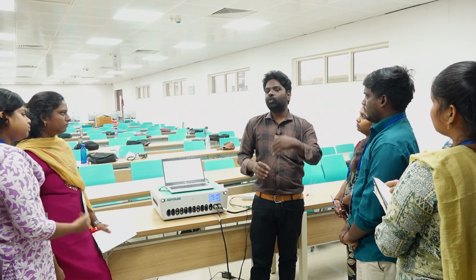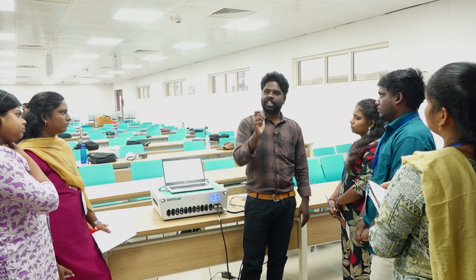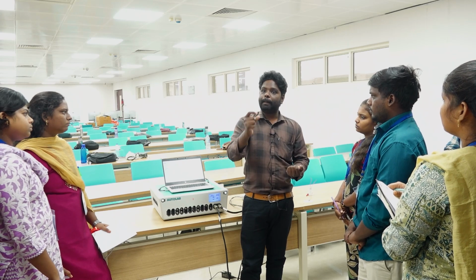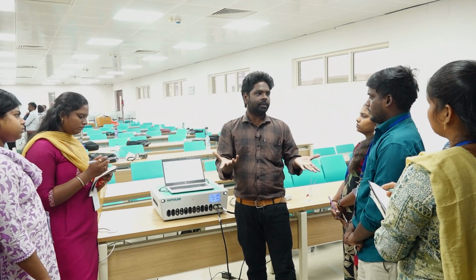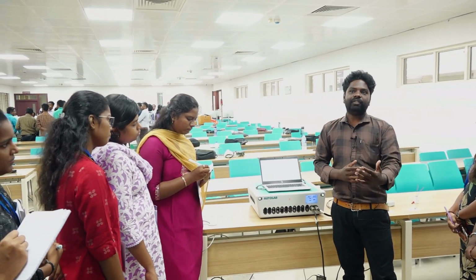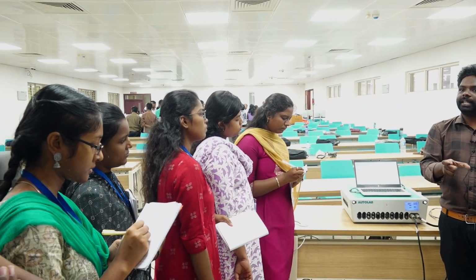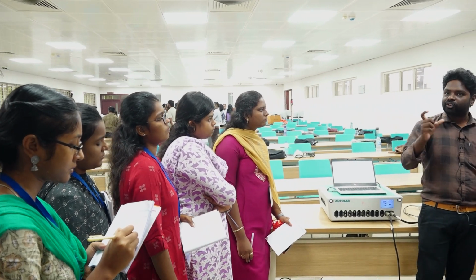So comparatively, if you take any other technique like CV, LSV, whatever the DC techniques, that is a destructive technique. That means if we are testing our sample, your sample must get destructive. We are applying input, we are polarizing the material, and your material will get disturbed, but in EIS it won't disturb much. Still we can measure whatever the actual properties of the material, that we can observe without destructing the sample. This is the advantage of EIS.